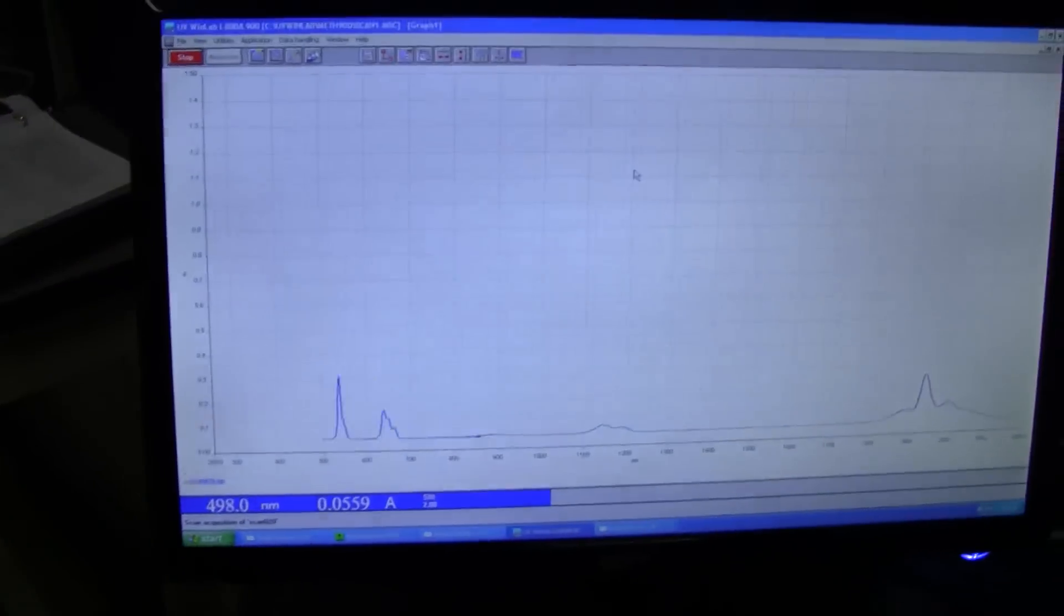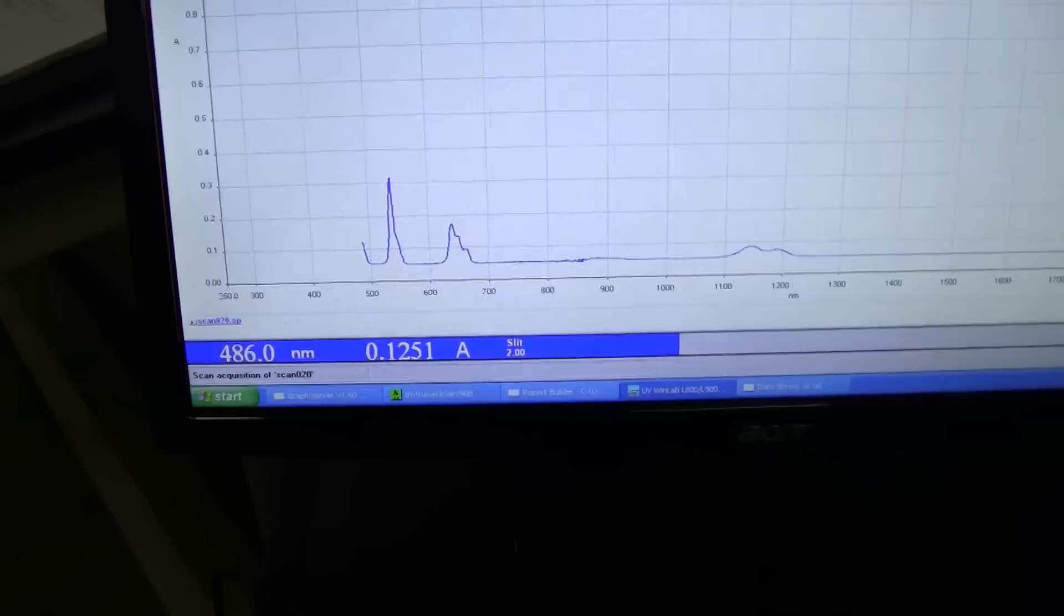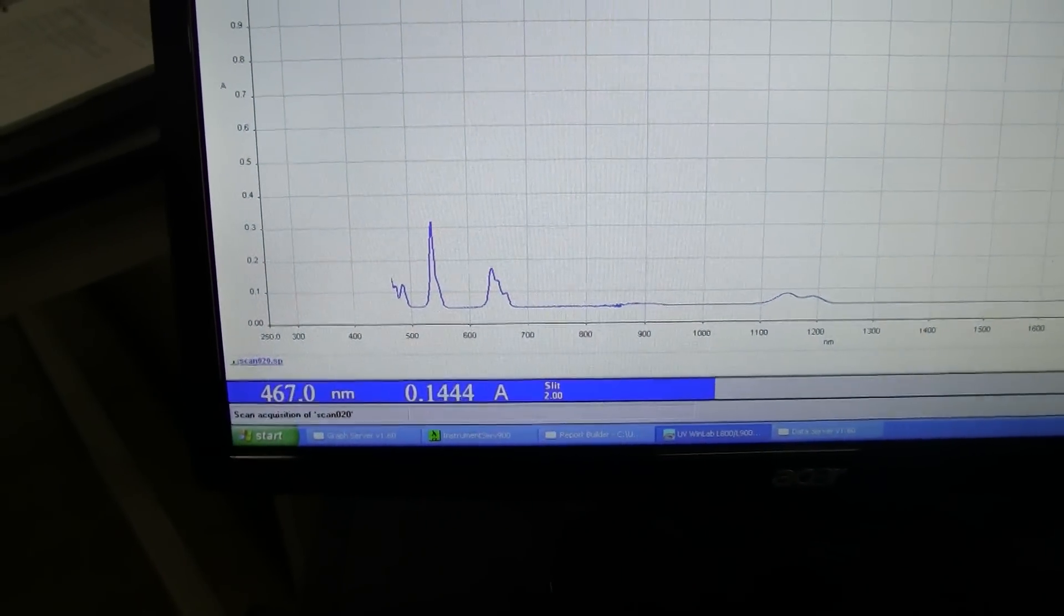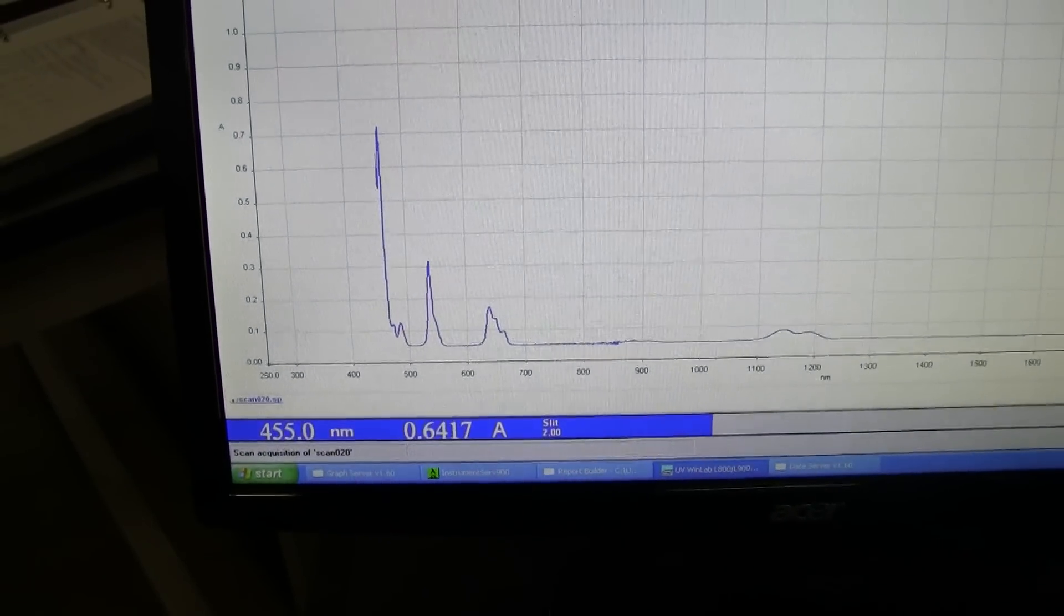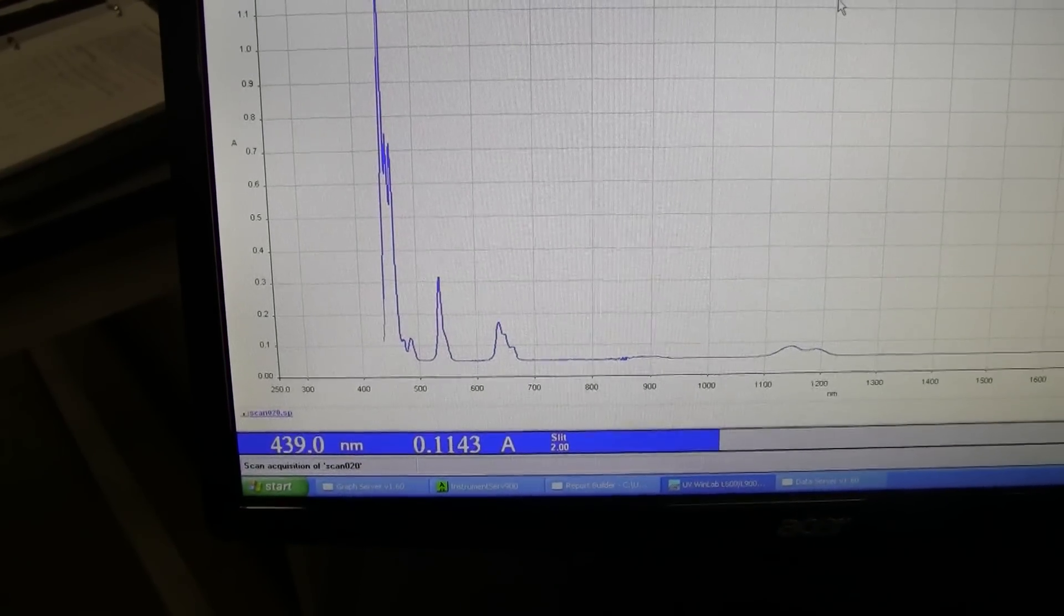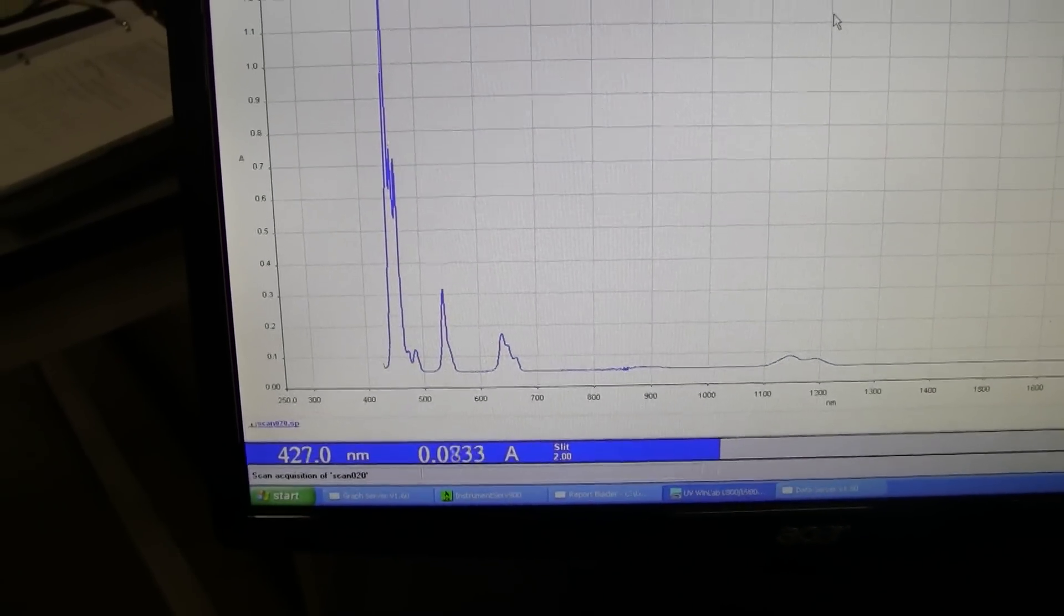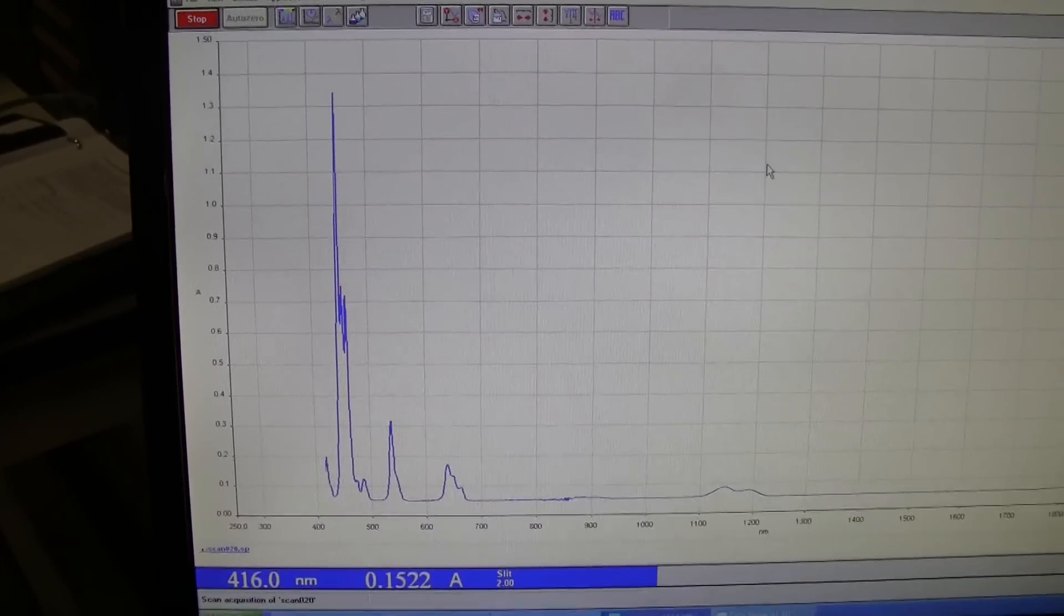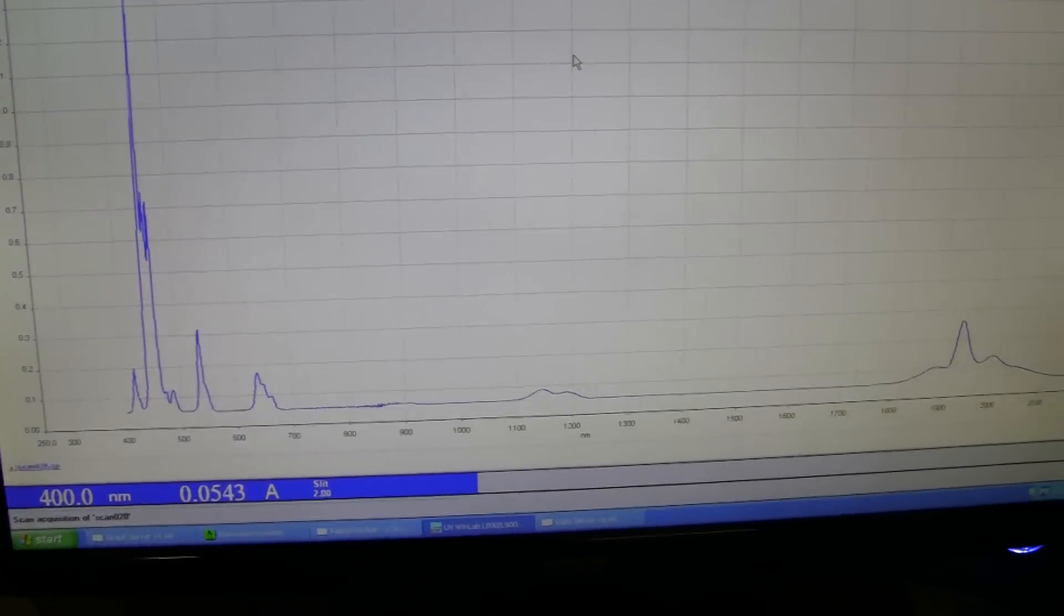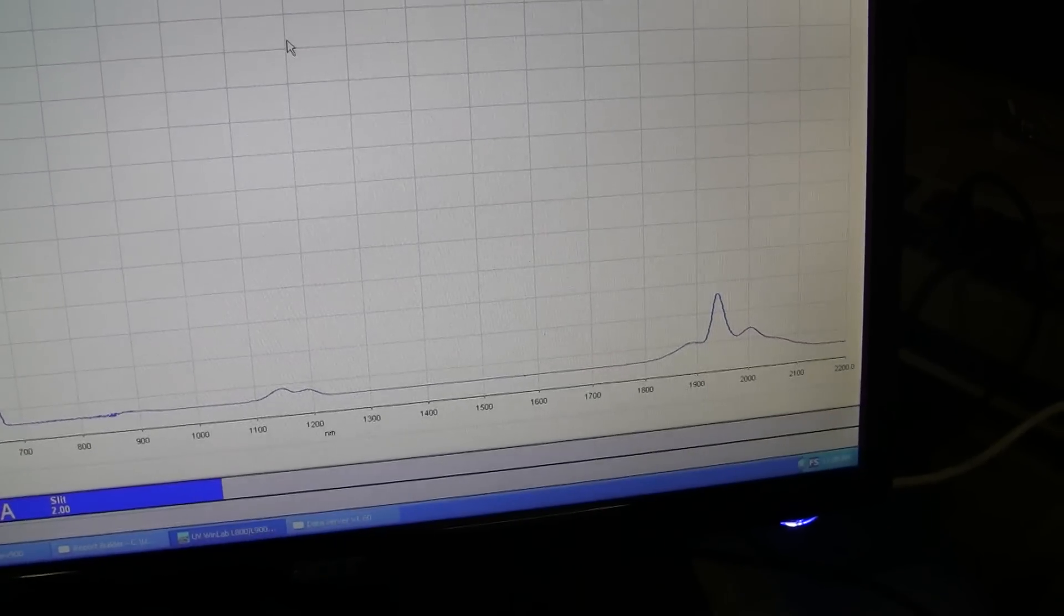You can see on the screen, it's actually currently running. There's a standard holmium sample in. Nice peaks. There's the peak of the Near-IR range.